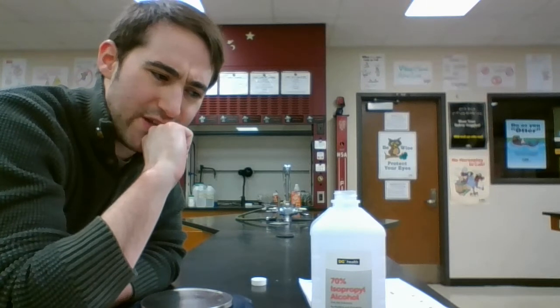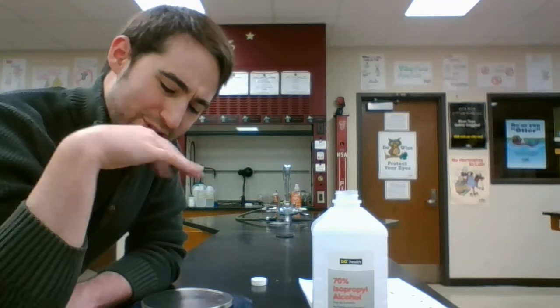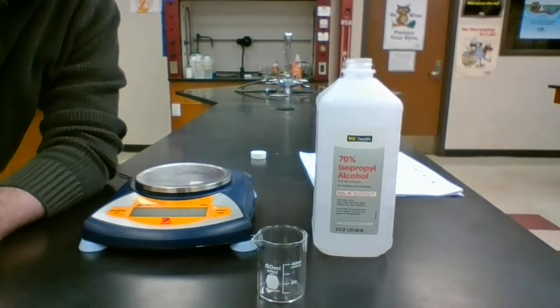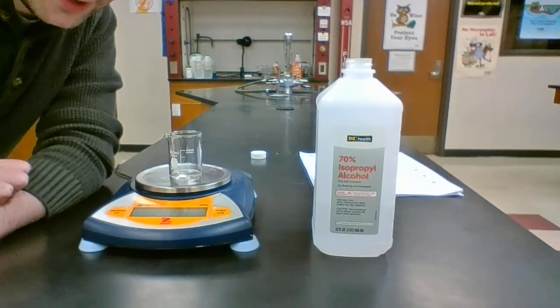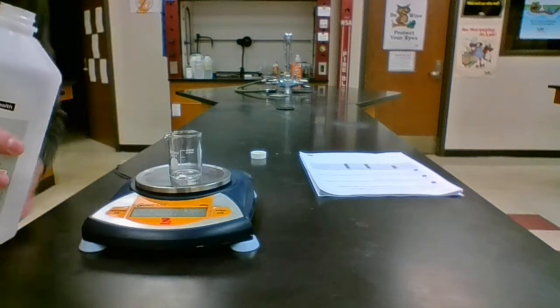So I want to get 20 milliliters of this rubbing alcohol. Turn on my scale. I want to make sure that I'm not including the mass of the beaker. So once my scale loads, tilt this down a little bit. I'm reading 0.0 grams. I'm going to put the beaker on the scale so it gives me the mass of the beaker. I zero it out because I don't care about that. And then I can add in my rubbing alcohol, about 20 milliliters.